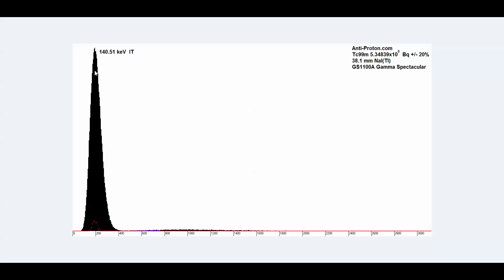The 140.51 keV peak is shown clearly via isomeric transition. And this was done with a sodium iodide detector of 1.5 inches. It fits 38.1 millimeters.